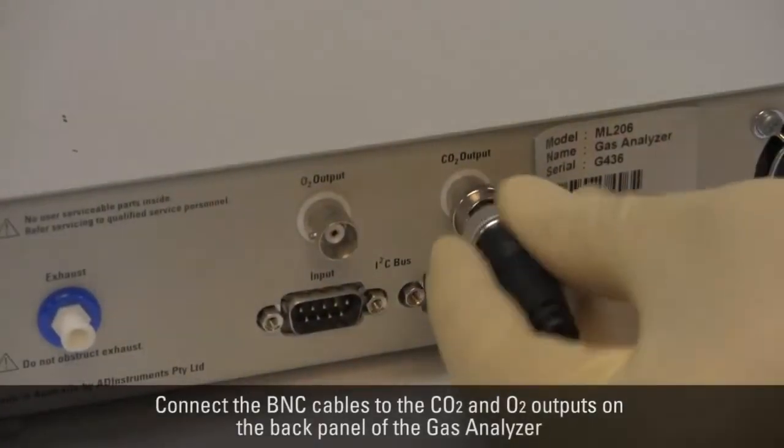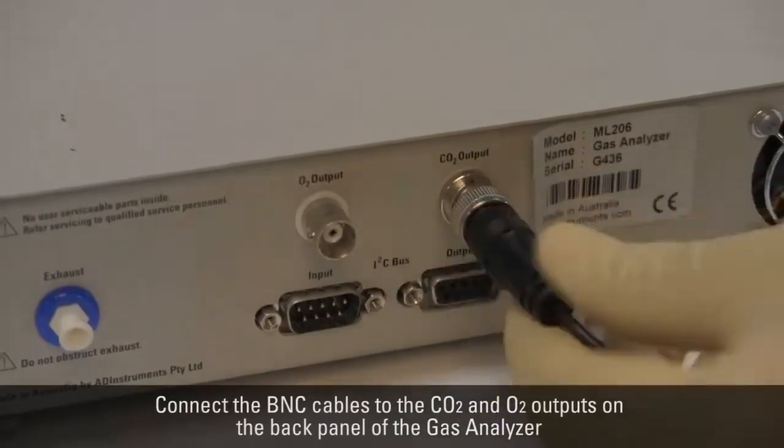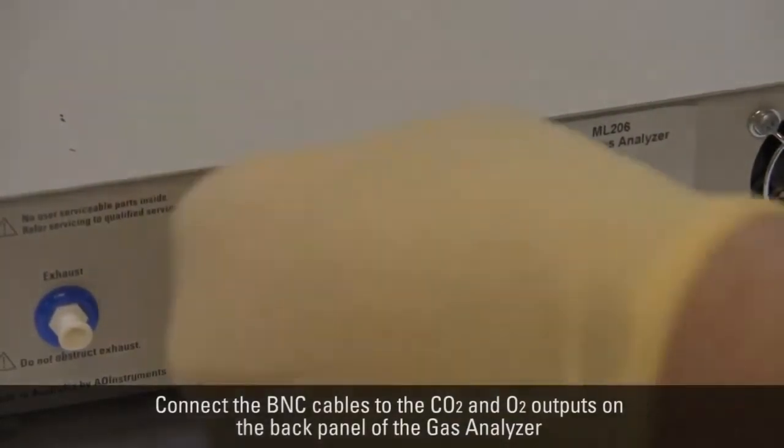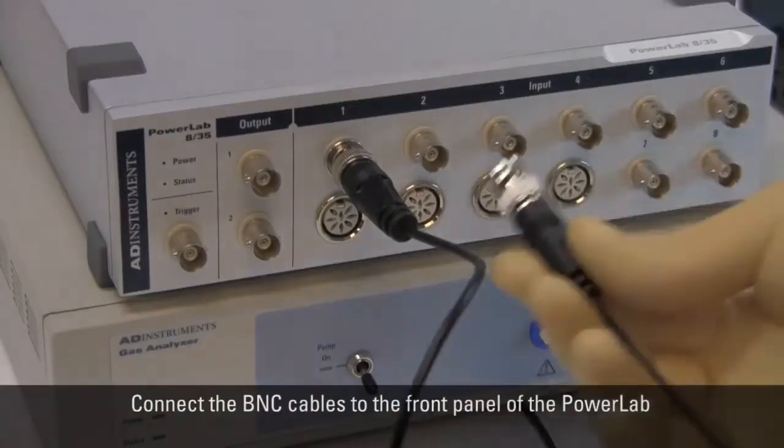Connect two B and C cables to the CO2 and O2 analog outputs on the back panel of the Gas Analyzer and the front panel of the PowerLab.